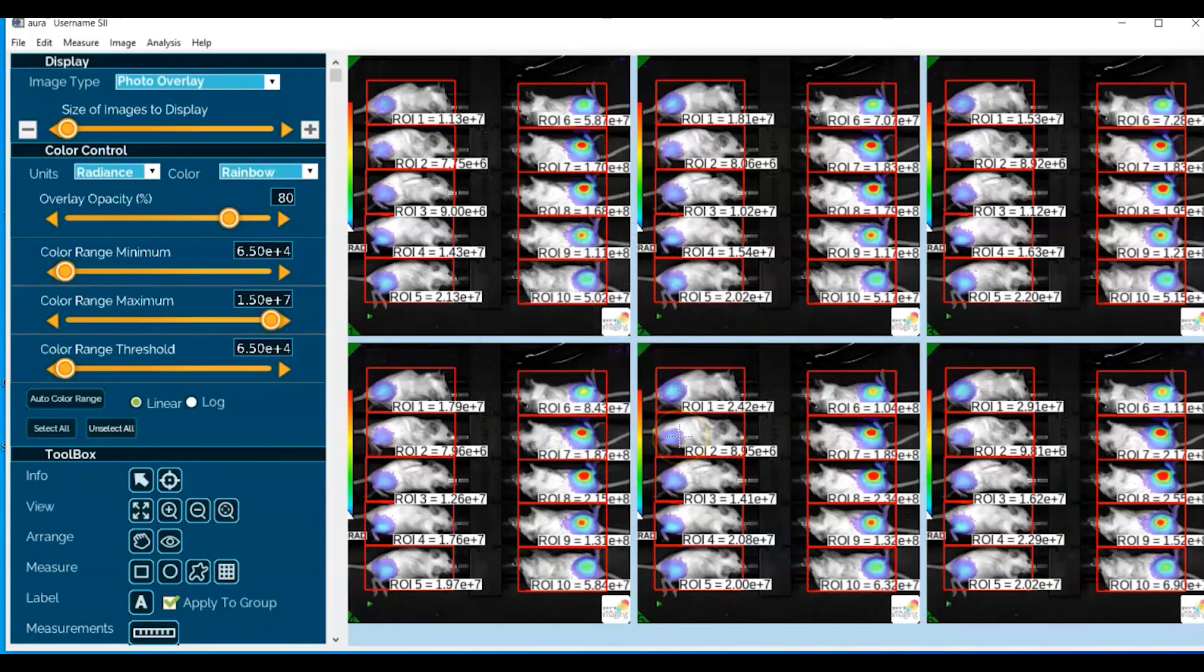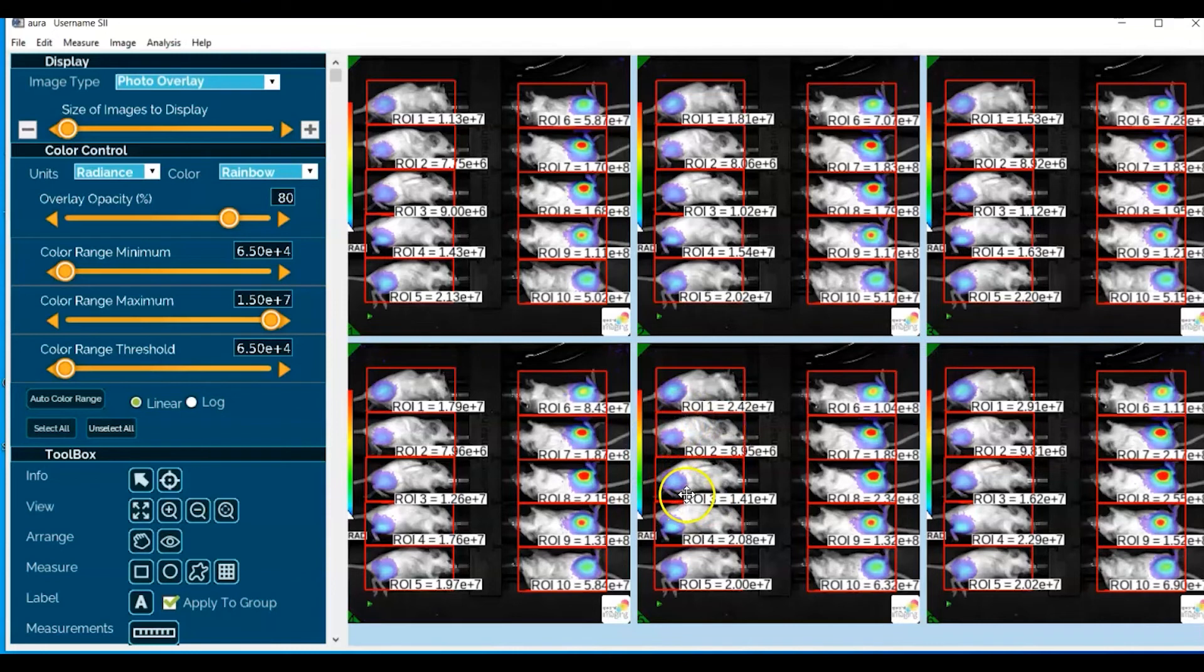Go ahead and make use of that image for any kind of presentation purposes or lab notes that you may need to keep.